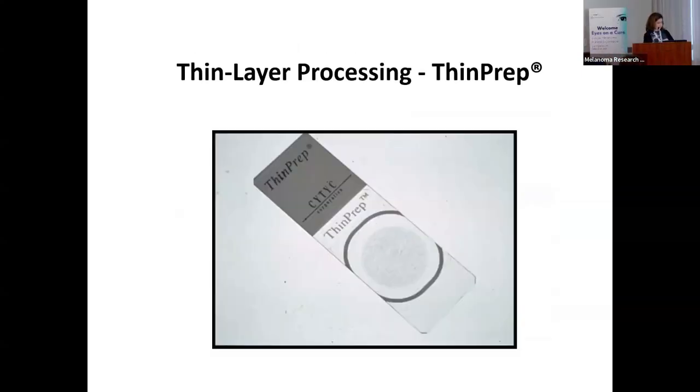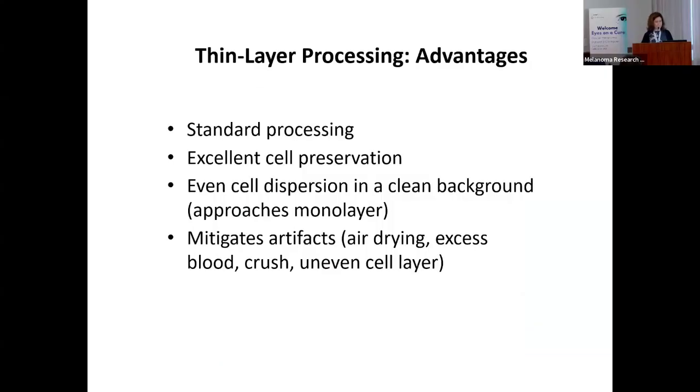And we make a slide, and the cells are in a single layer in the center of this glass slide. Why do we use these methods? There's standards. It's a standard processing. It's not subject to a lab tech who might be having a good or a bad day. Their technique doesn't matter.